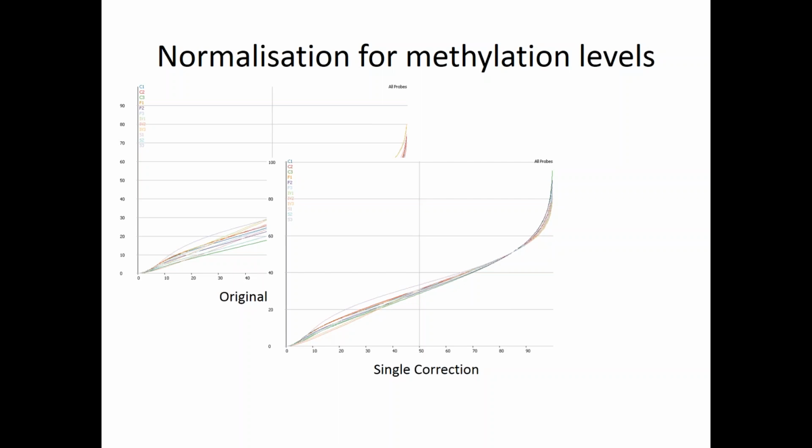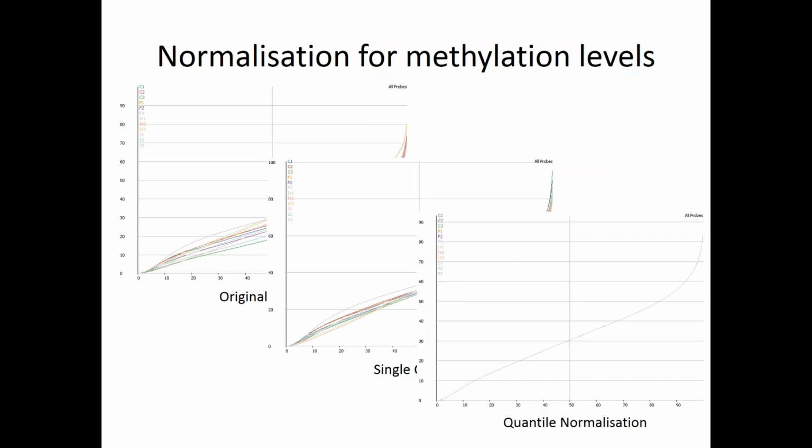On a slightly more extreme level, you can also do things like quantile normalization, where you force all of the data onto the same distribution, which is kind of less satisfying academically, but produces a very clean looking result. But in each case, what you end up with are normalized values which are not the values that you got from your original data. And this would then cause a problem when you actually want to do the statistics, because the counts won't reflect the quantitative values that you've normalized.